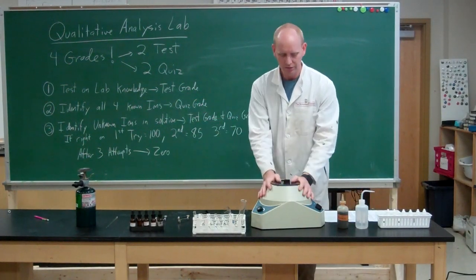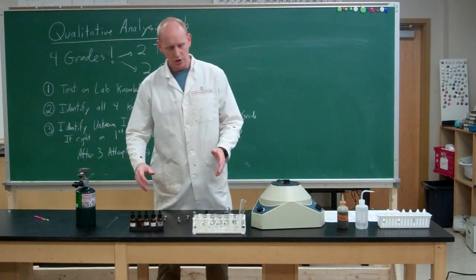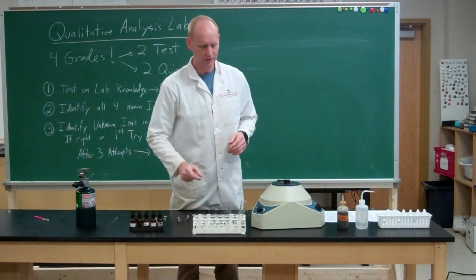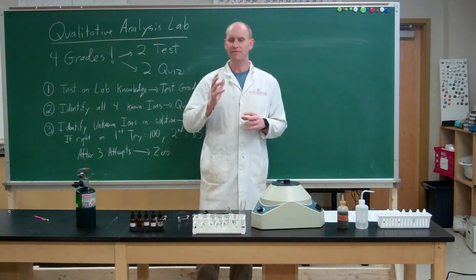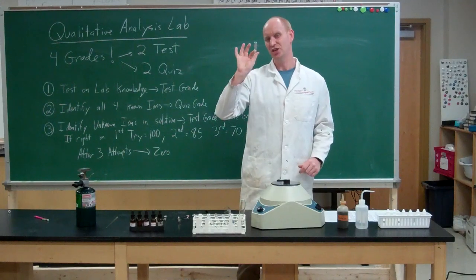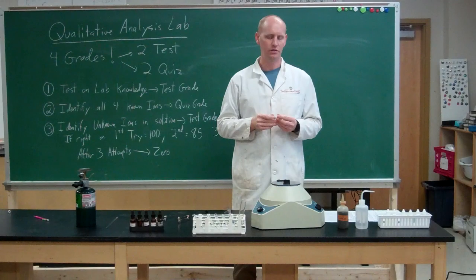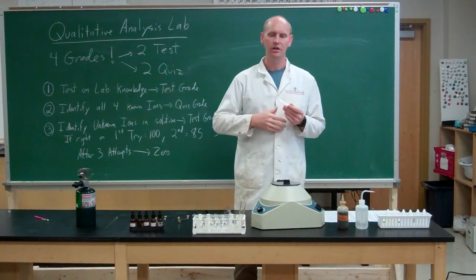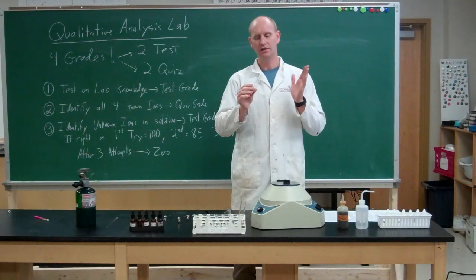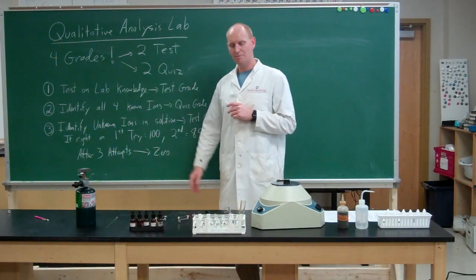This big thing here is a centrifuge. We'll get into centrifuge operation in a minute. And then you'll need some small test tubes and a big test tube. As a general rule, we say to grab 5 or 6 small test tubes. We have plenty of these, but they're dirty. So if you ever grab a test tube out of the box, the very first thing you need to do is to wash it with some glass cleaner, rinse it out with a little bit of distilled water so that you don't have any contamination in there, particularly when you're doing your unknown.